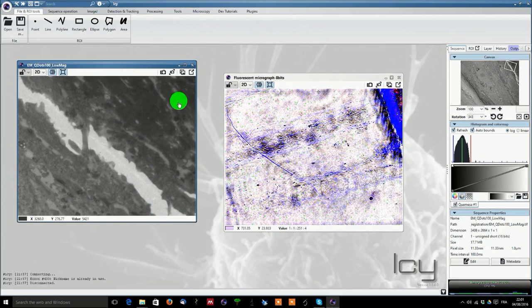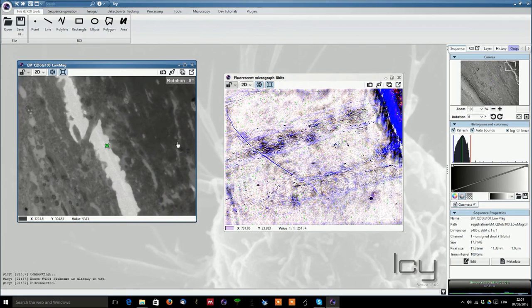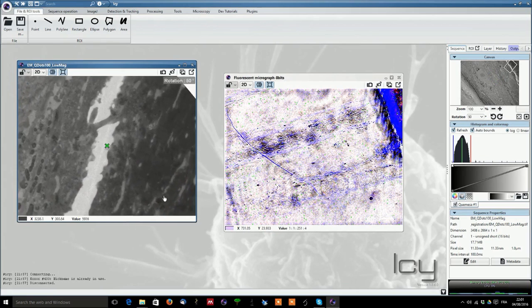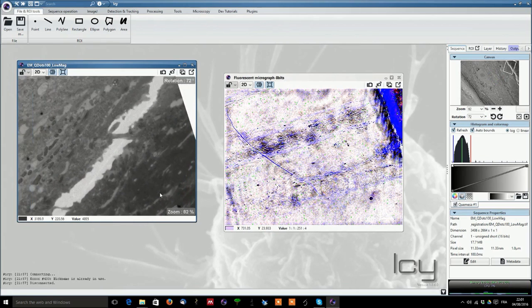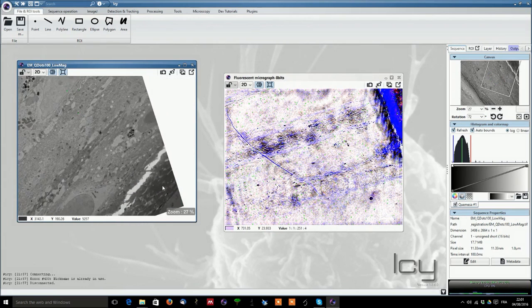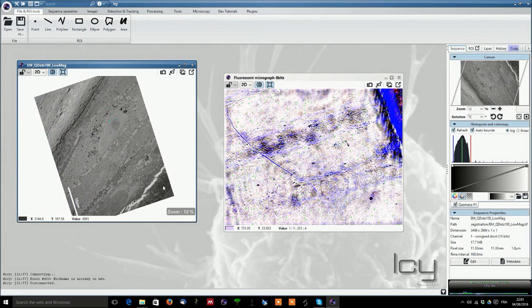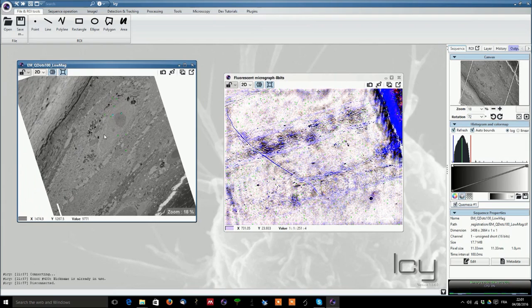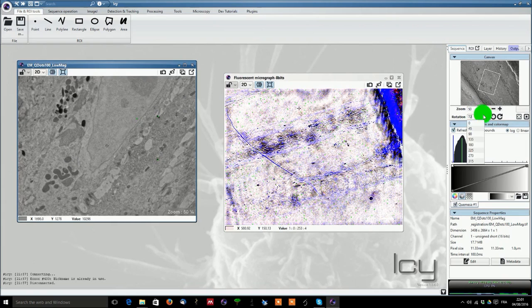If you are around the side corner of the image, like going there, the rotation will always happen in the center of the image as you can see then we have rotated somewhere else out of the image.